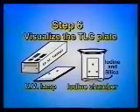When the solvent front, that is, the line between the wet and dry, is about 1 centimeter from the top of the plate, carefully remove the plate from the developing tank, again using tweezers. Mark the solvent front with a pencil, not a pen. Allow the solvent to evaporate and the TLC plate to dry. We are ready to visualize the results.